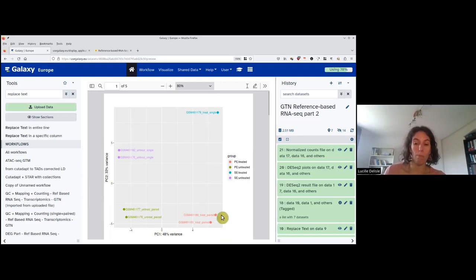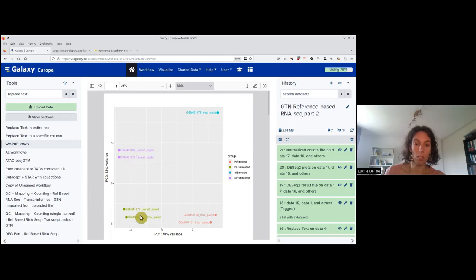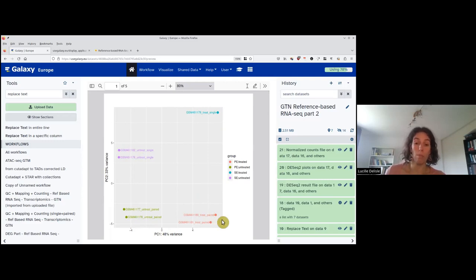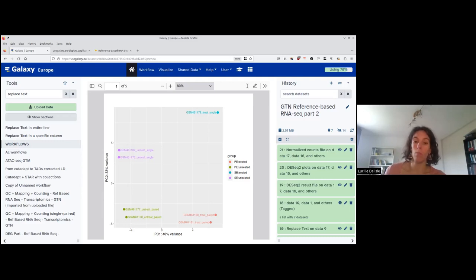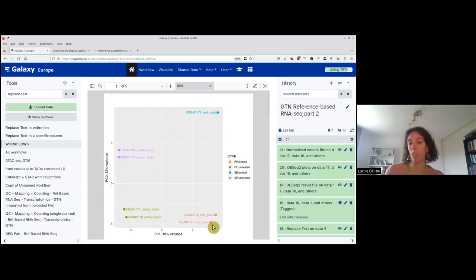On the left we see untreated single and untreated paired, and on the right we have treated single and treated paired. This is very good news — the main variation comes from the treatment. We treated the Drosophila cells with RNA interference to decrease expression of Pasilla, and this explains the most variation between samples. The second source of variation (33%) is explained by the sequencing type — single versus paired.